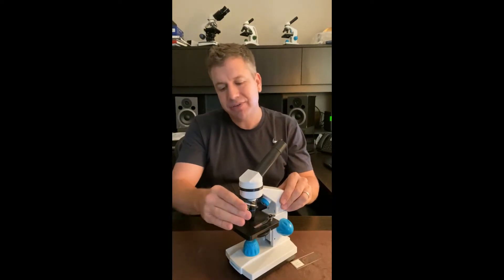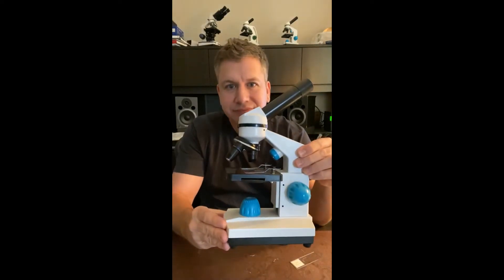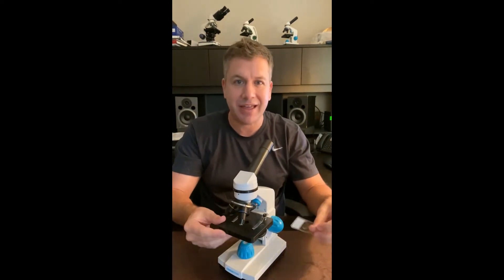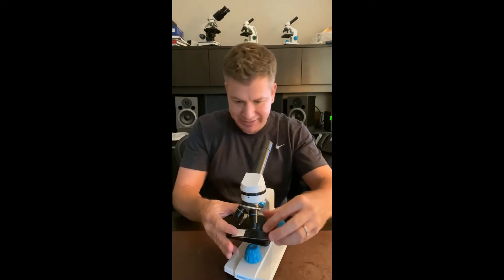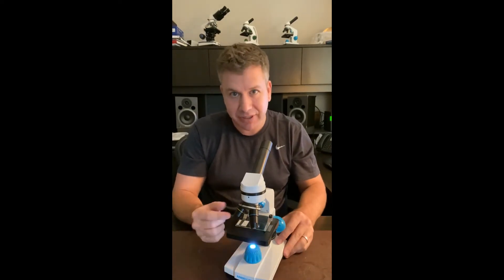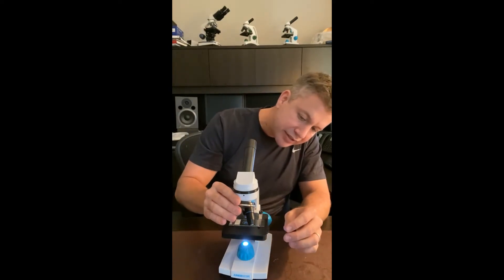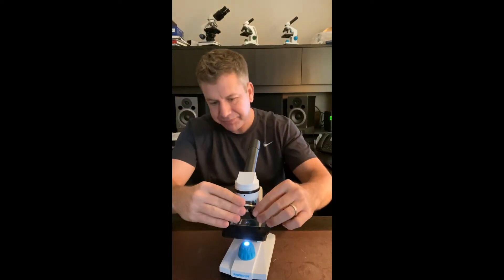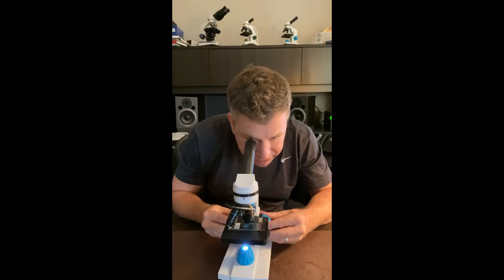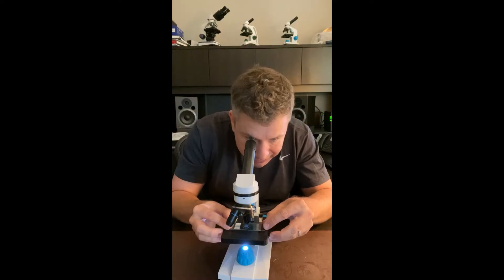The next thing I want to show you are the three different objective lenses. The shortest one, which is the red one, is the lowest magnification, and that's the best one to start with because it's easier to find whatever you're trying to look at. Once you locate it — in this case we'd be looking at the slide — you can then switch to the next objective, which is yellow. That takes you up to 100x, and you may have to adjust with the focus knobs a little bit and possibly move the slide to relocate your specimen.